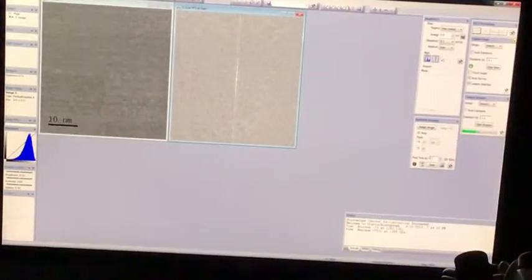Okay, I'm back. I've realised that probably the best way to do the rest of the lab is to just focus on the computer screen, and I'll tell you what's going on. If they really need to focus on the fluorescent screen again, I will divert the camera that way. However, we can search the specimen entirely in the view of that left-hand camera.